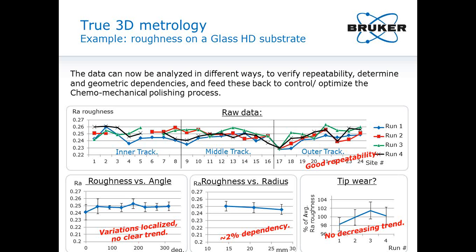Increased local roughness could be due to sample contamination. For reduced roughness, this is less likely. However, the effect is within the standard deviation of the measurement and doesn't show trends, for example a sinusoidal. A slight linear roughness variation as a function of disk radius seems more consistent in this data and could be considered for the polishing process.